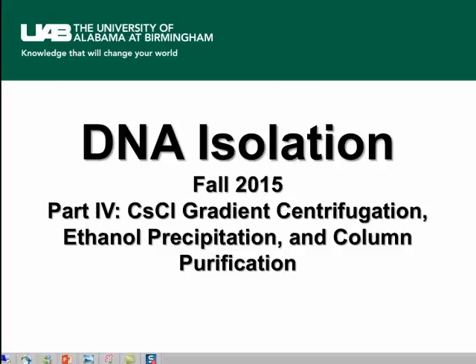And now that you have a semi-pure lysate for DNA isolation, in part 4 we're going to look at what you do to purify that lysate using cesium chloride gradient centrifugation, ethanol precipitation, and column purification.